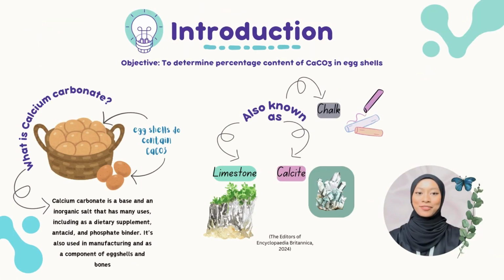Hi everyone, I am Husnina and today we are going to discuss how to determine the percentage of calcium carbonate in eggshells through volumetric analysis. First, let's have a quick explanation.